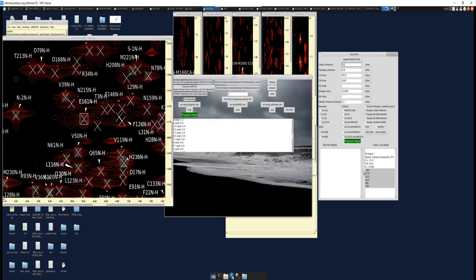So both of these can be very useful as you go through for assigning your protein. It just helps accelerate the process and make it easier, right? As you saw how easily we were able to find the I-1 once we were able to use the C alpha, C beta, and NOE values, right? So strip plot can be, I think, quite a useful, important tool.